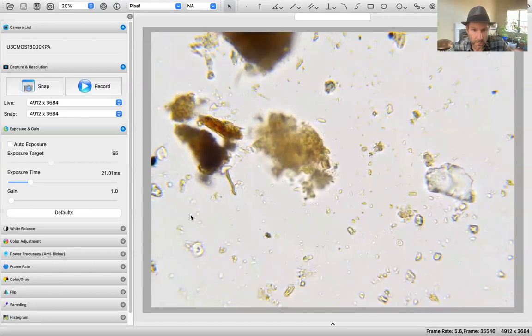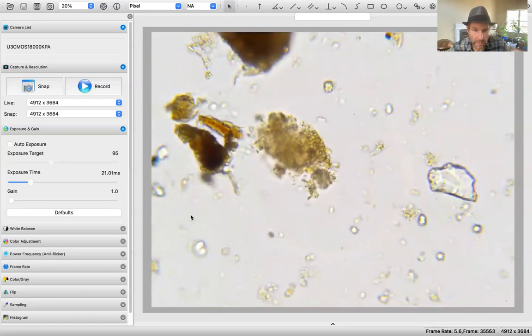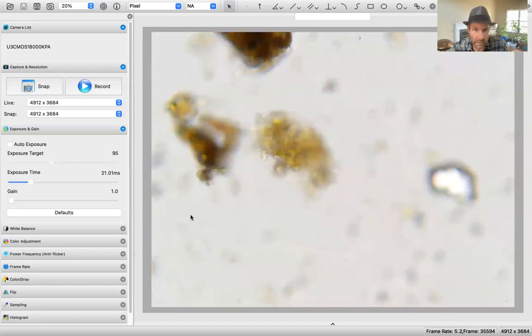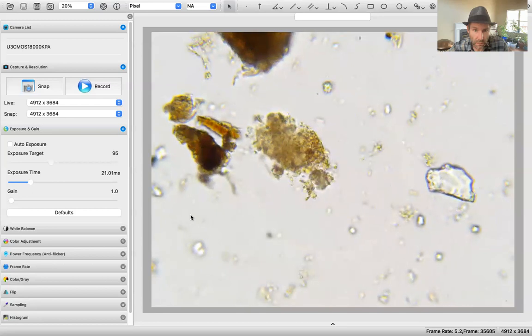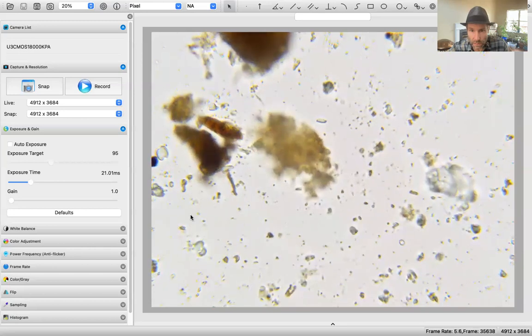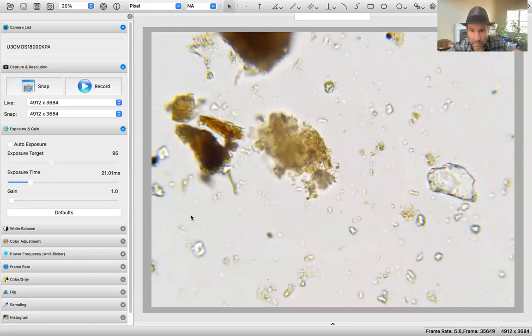Oh, so actives. That's what we need is actives. All the way to the top, back down again. I do not see. Ooh, what is that? No, it must have been bacteria zooming by.